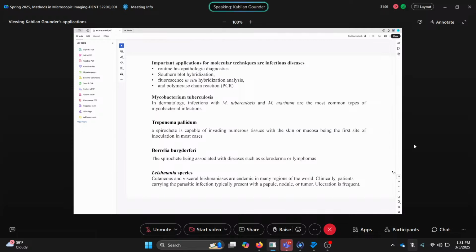So these are all the basic downstream applications, which help to identify novel genes, for diagnosis purposes and also treatment options, so that the isolation of cells is giving you reliable treatment options. So with this, we completed the laser capture microdissection technique. The next one is the scanning electron microscope and the electron microscope.